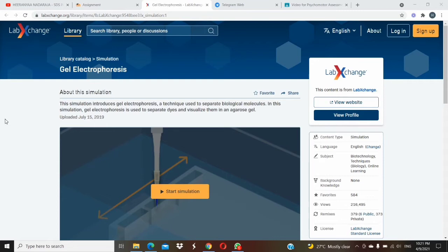When an agarose gel is melted and then cooled in aqueous solution, hydrogen bonding causes it to form a gel. Under the influence of an electric field, a population of DNA fragments generated by restriction enzyme will move through an agarose gel, whereby negatively charged DNA molecules will be drawn to the anode.